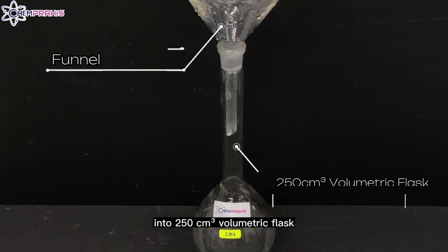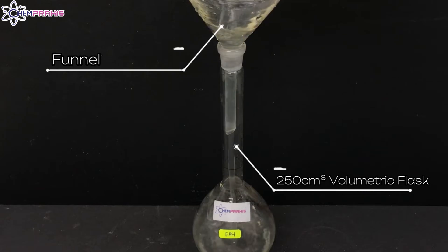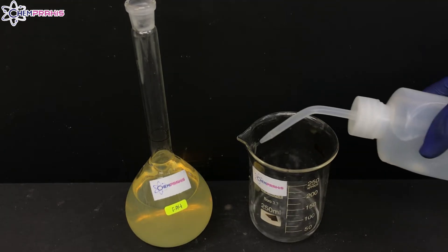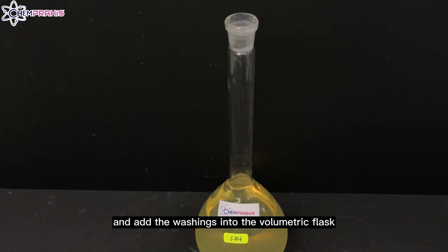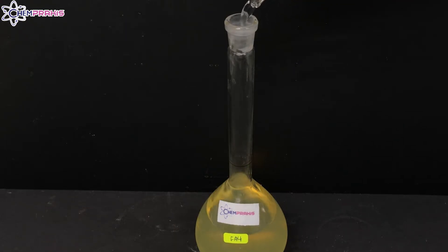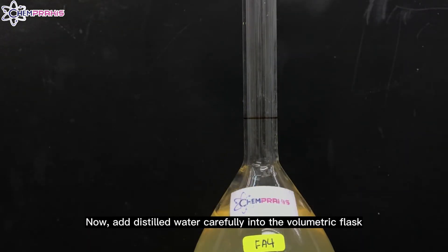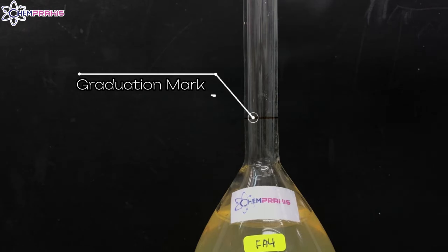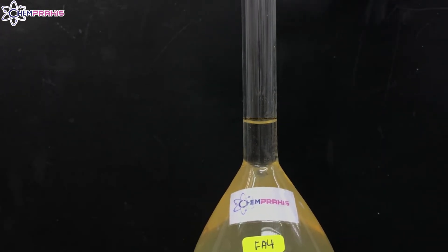Now we'll pour the contents from the beaker into a 250 cm³ volumetric flask. Rinse the beaker with some distilled water and add the washings into the volumetric flask. Then add distilled water carefully into the volumetric flask until it reaches the graduation mark.